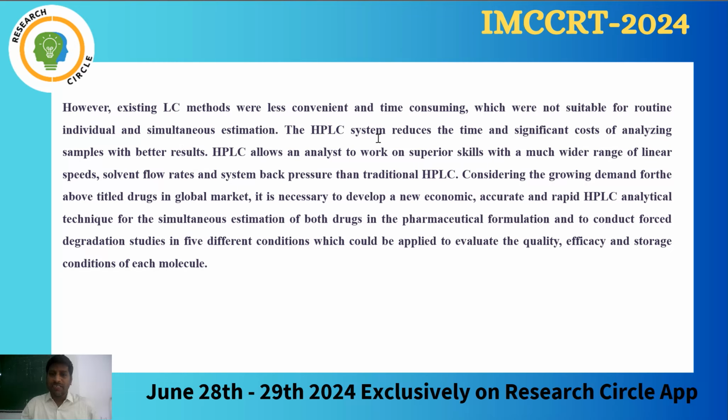The HPLC system reduces the time and significant cost of analyzing samples with better results, because by using HPLC we can complete the process in less time, because in industry we have to analyze many samples. So time reduction is very important, as well as cost reduction. High performance liquid chromatography allows an analyst to work with a much wider range of linear speed, solvent flow rates and back pressure than traditional HPLC.